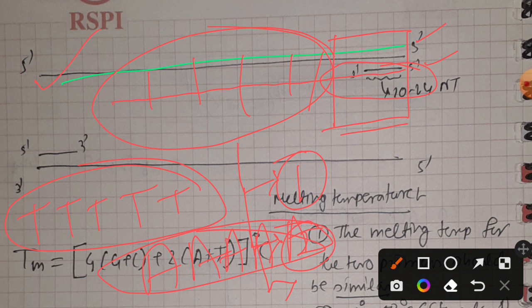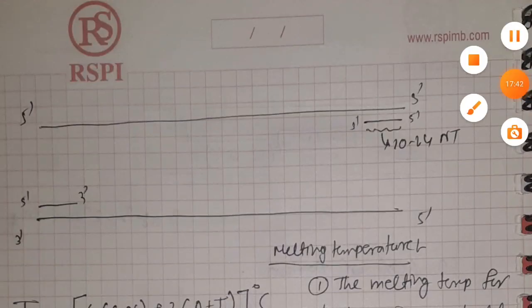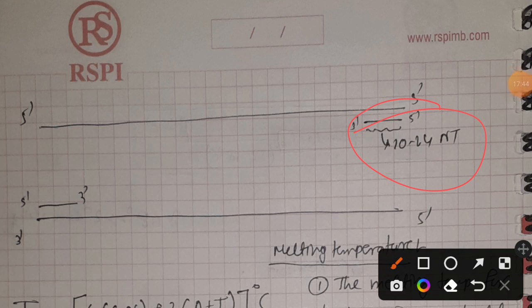That is why the length of the primer is kept at 20 to 24 nucleotides. And among those 20 to 24 nucleotides, it is very important to take fewer than 4 nucleotides which are repetitive, or which can promote self complementation, self hybridization you can also say, or the same cause which can promote self complementarity.